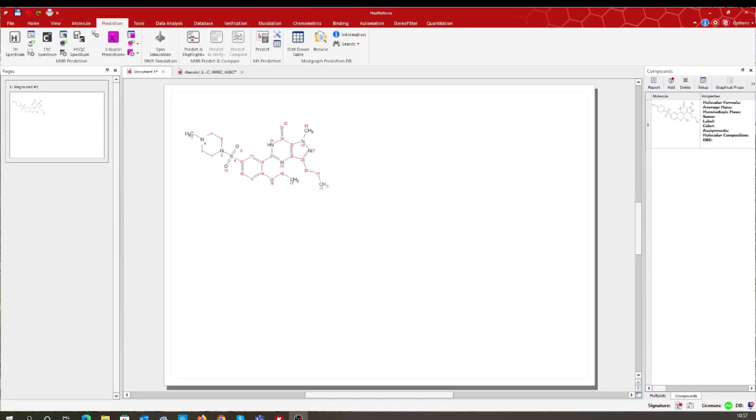Hi! Did you know that within MNOVA you can predict the NMR spectra of your reagents and products?